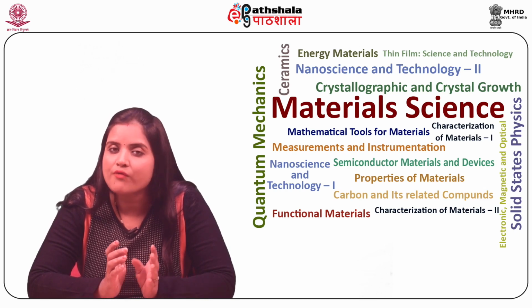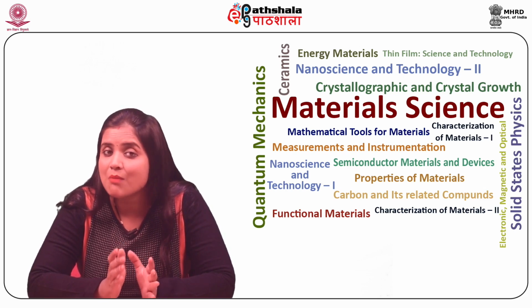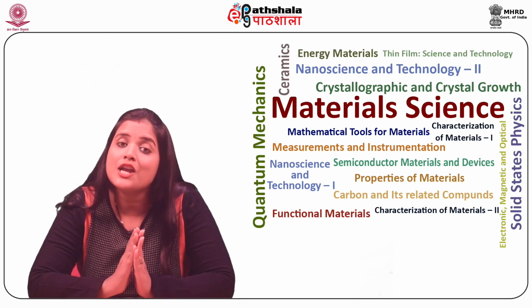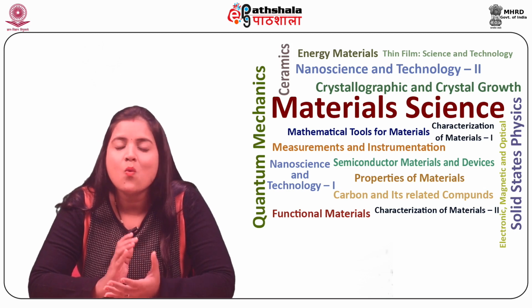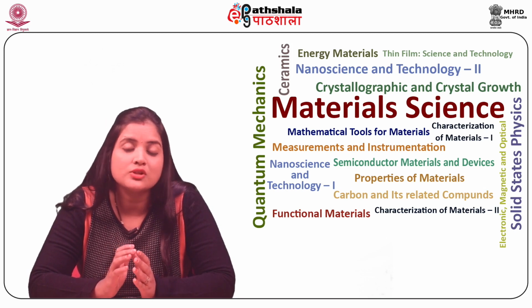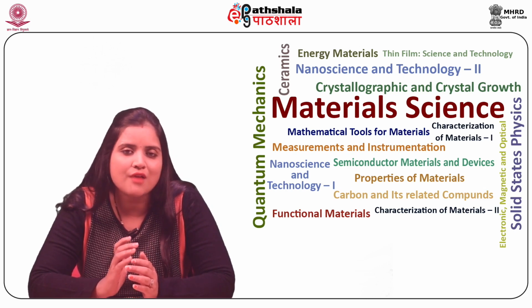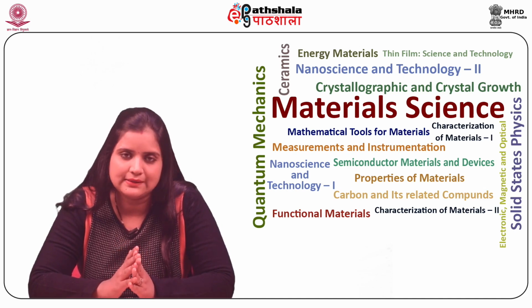The development of affordable, high-resolution and high-speed digital cameras, along with increased computer processing abilities, have seen holography enter a new phase over the last 2 decades. While the first digital processing of the hologram was performed in 1967, it was not until the early 2000s that digital holographic microscopy started to supersede film-based techniques.